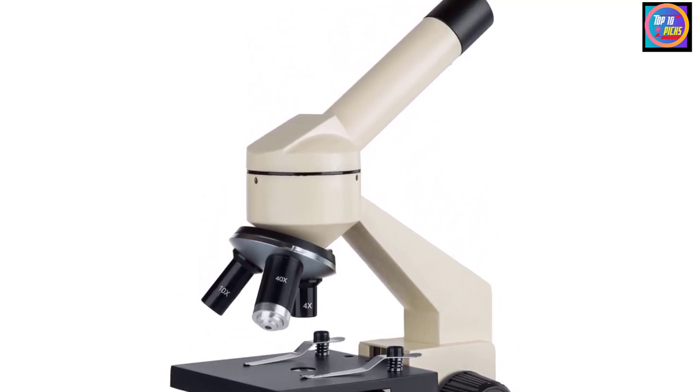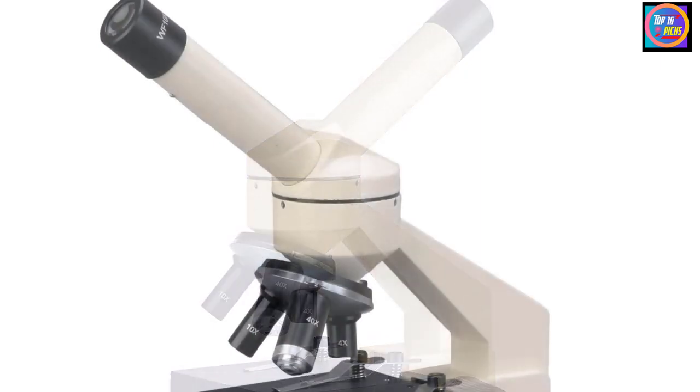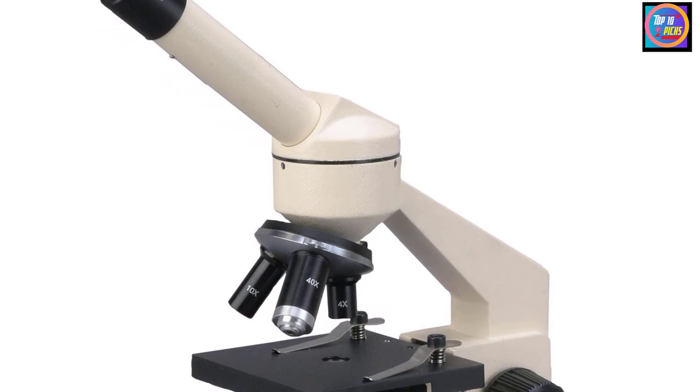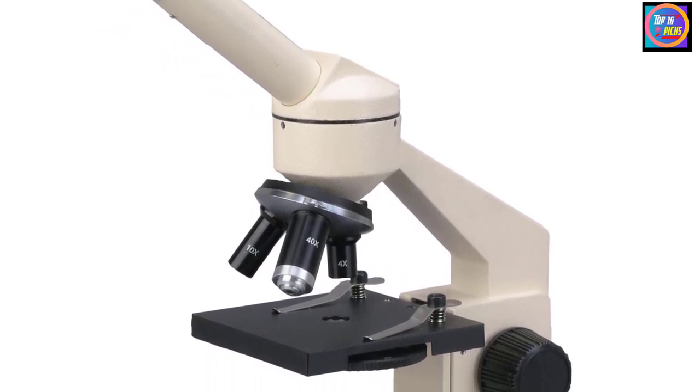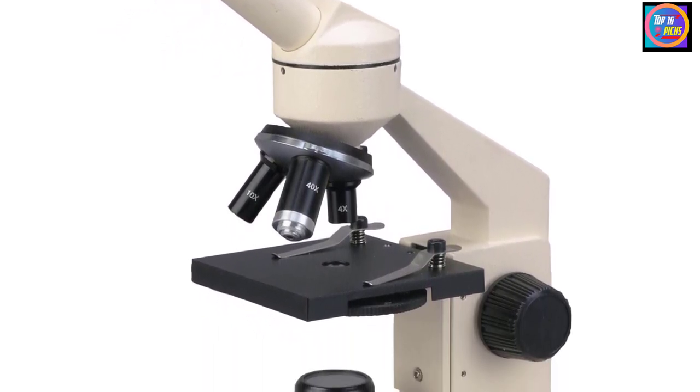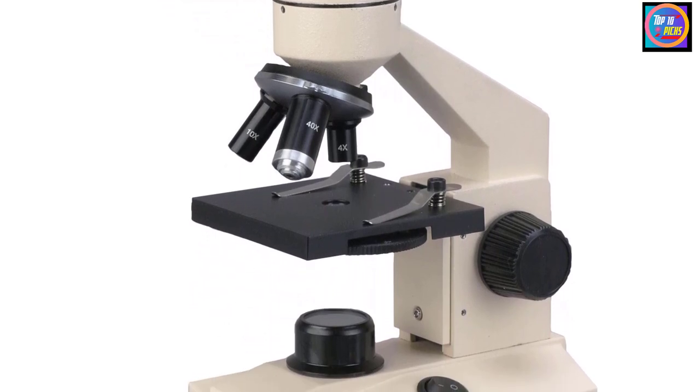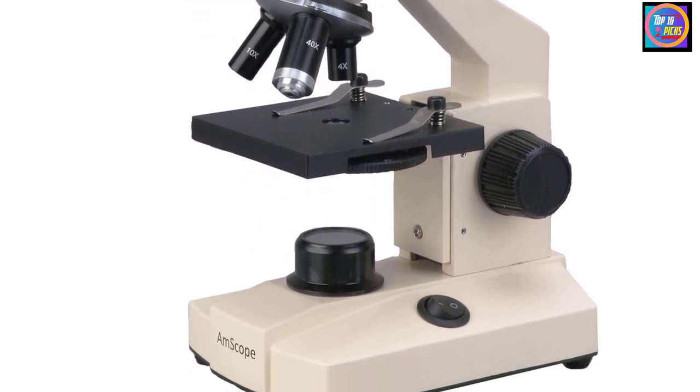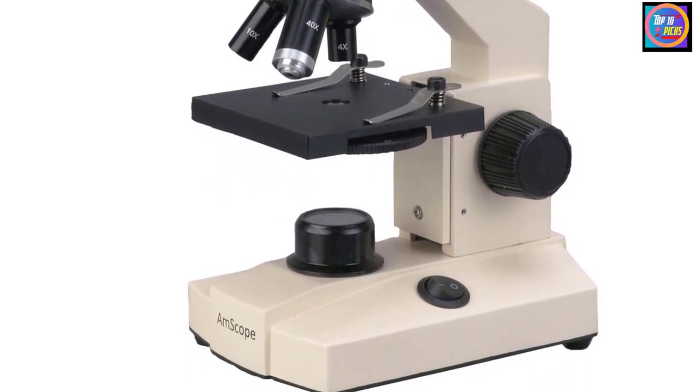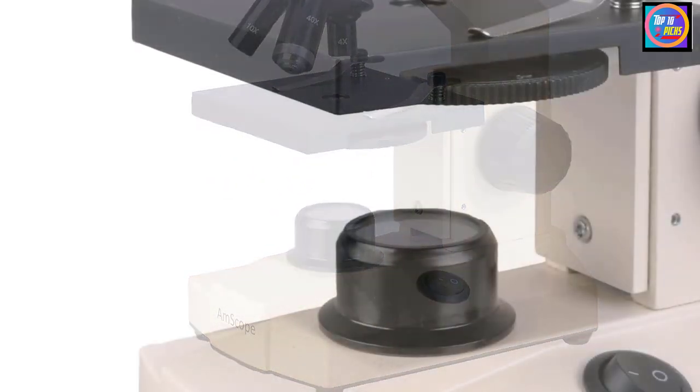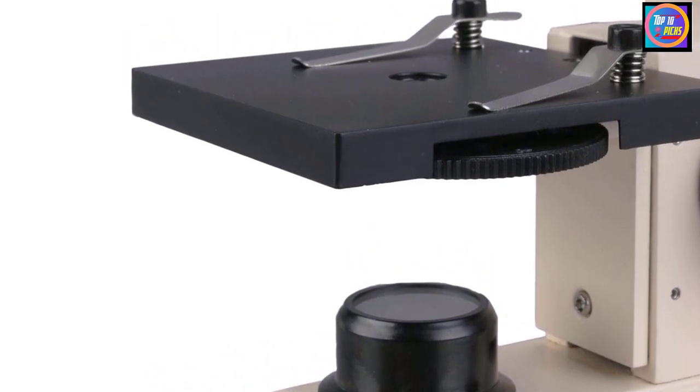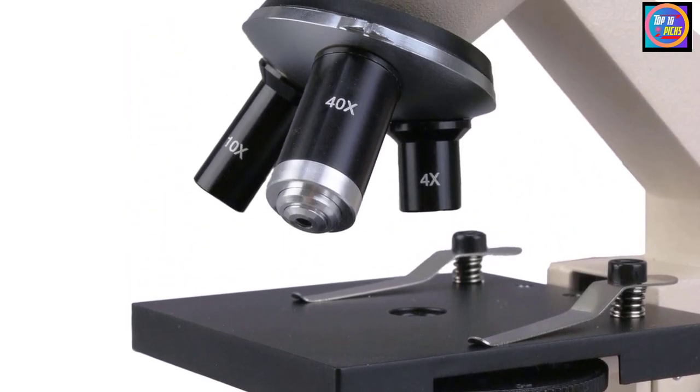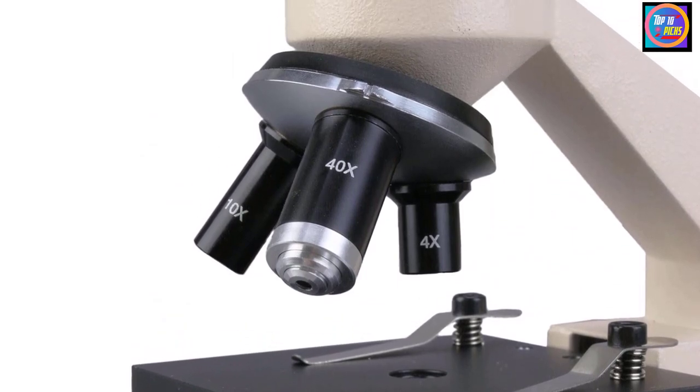It has a sturdy all-metal body with an enamel finish, 5 magnification settings up to 1000x high-quality coated optical glass, plus coarse and fine combo focus knobs on both sides for precise adjustments without having to lift your hands. There's also 3 objective lenses and 2 wide-field eyepieces. The main drawback is that the microscope doesn't have a dual LED light to see opaque specimens illuminated from above.